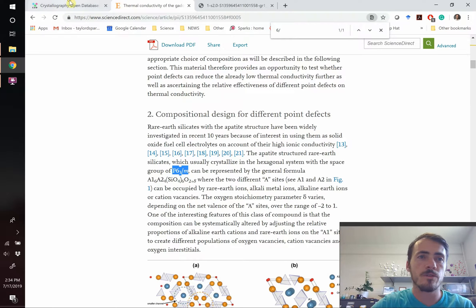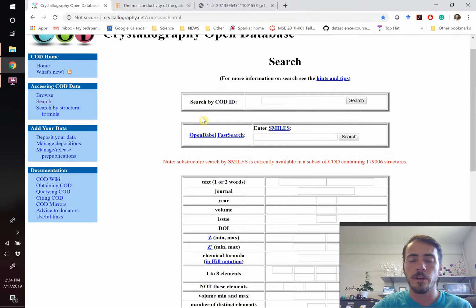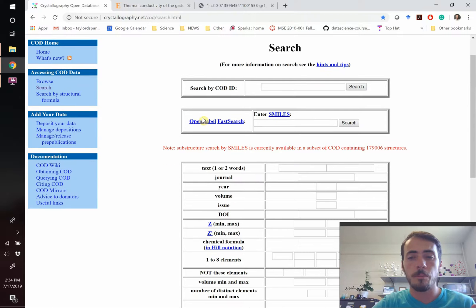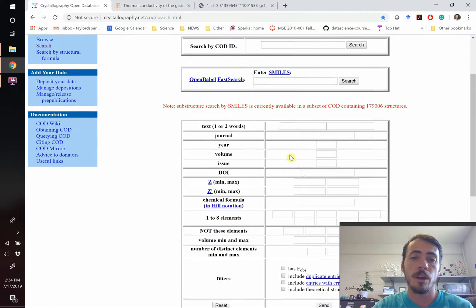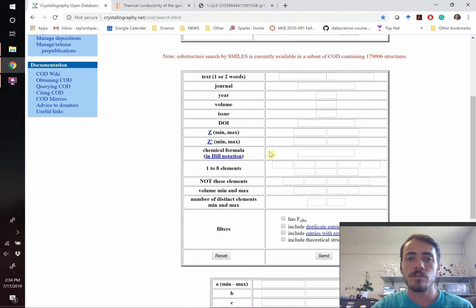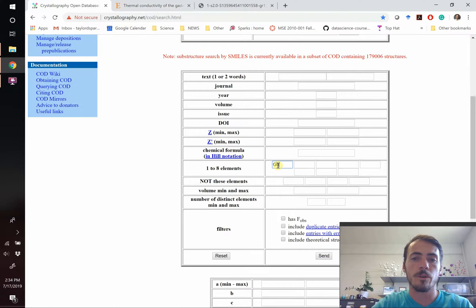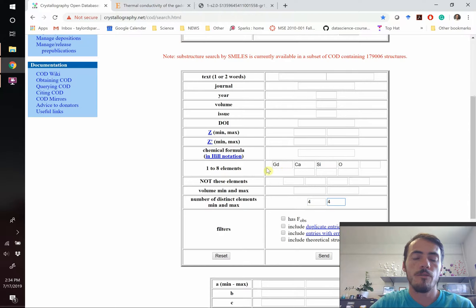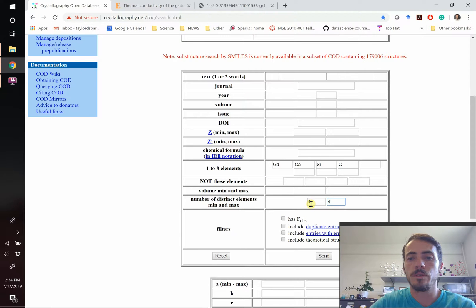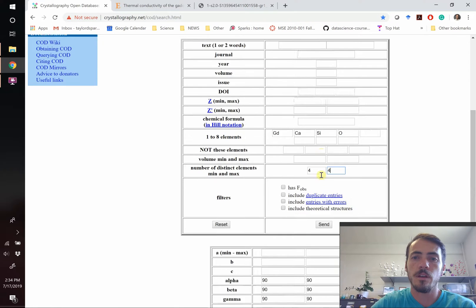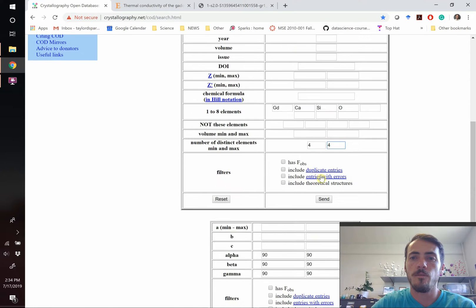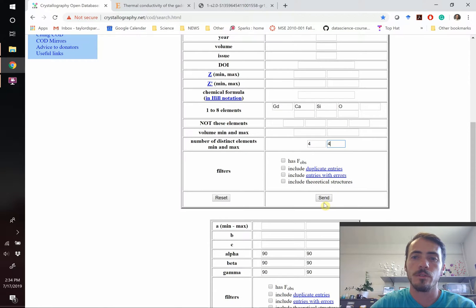So let's go ahead and do a search for this using the crystallographic open database. If you've got the Pearson database or ICSD or anything else, great. Those are all paid versions. So let's start with the free one for those that don't have it. We're going to punch in gadolinium, calcium, silicon, oxygen, and search for formulas that have at least four distinct elements and no more than four. That's going to pull up only things that fit that formula. It's not going to tell us the ratio of the elements, but it has to have those four things in it.